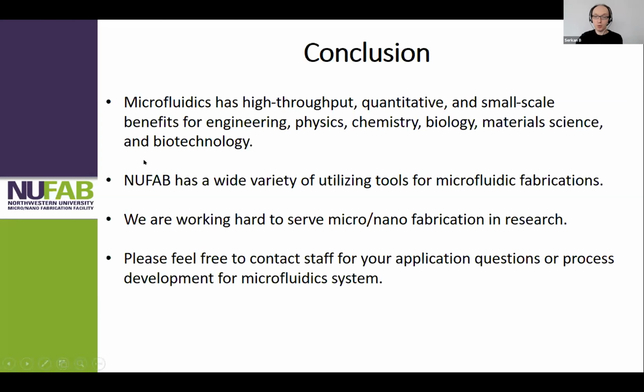And we have a lot of tools that make it possible. Virtually, you can make any kind of microfluidic device you can think of. We have other support tools as well if you need different dielectric coatings or electrical contacts. You can do that here at NUFAB too for complicated microfluidic devices.